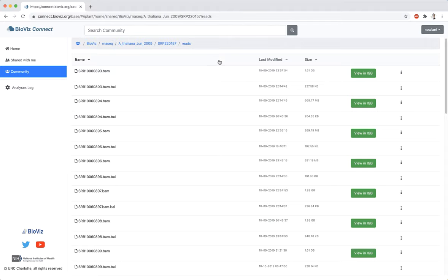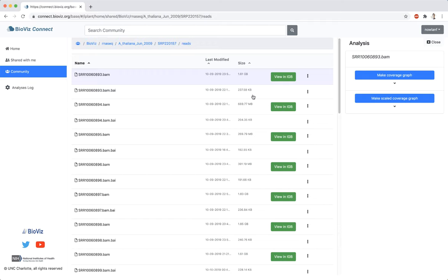To view the Analysis Write panel, right-click and select Analyze. The Analysis Write panel will only show apps that can be run on the selected file.